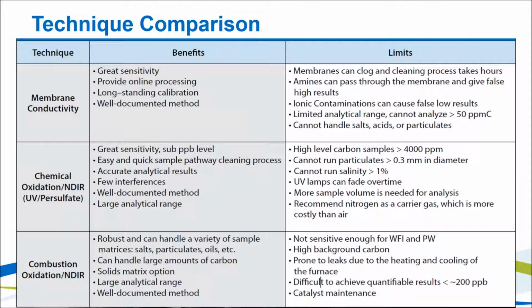It's not sensitive enough. Typically, it's not sensitive enough for water for injection and purified water. So the detection, since there's so much high background carbon coming off that catalyst, so you're using a catalyst and heat and oxygen to convert that carbon to CO2. The catalyst gives off quite a bit of carbon, so it's hard to do really low level analysis. So not the best for pharmaceutical applications. It also can be prone to leaks due to the heating and cooling of the furnace. So you have all those fittings around the furnace, and as you heat and cool, they expand and contract, and you can develop leaks around it.